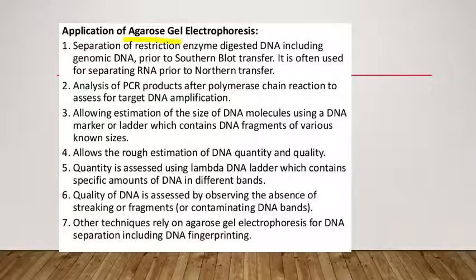What are the applications of agarose gel electrophoresis? It is used for the separation of restriction enzyme digested DNA, including genomic DNA, prior to other methods.